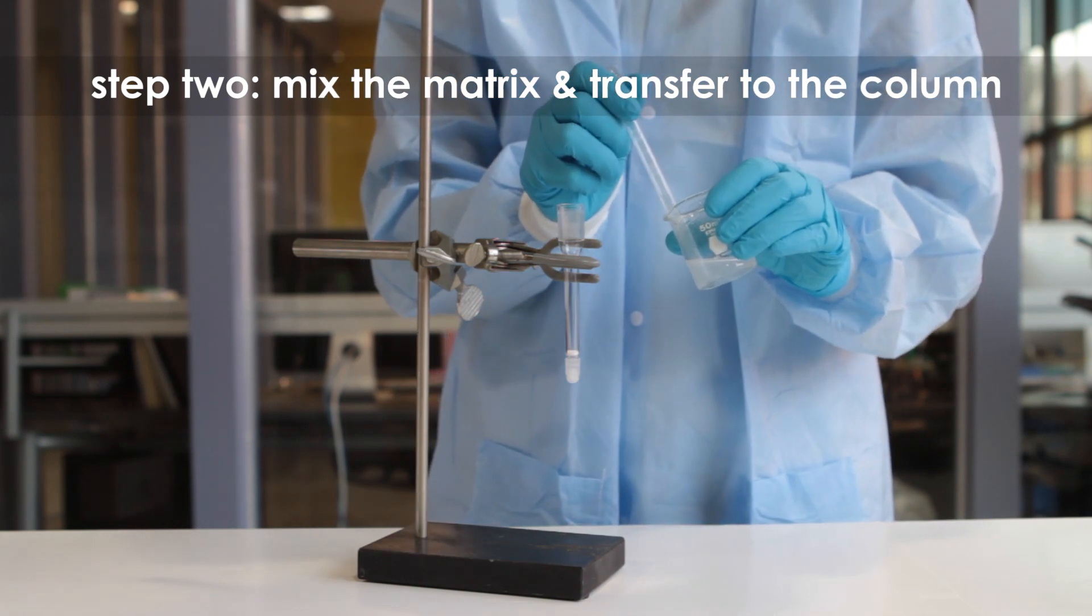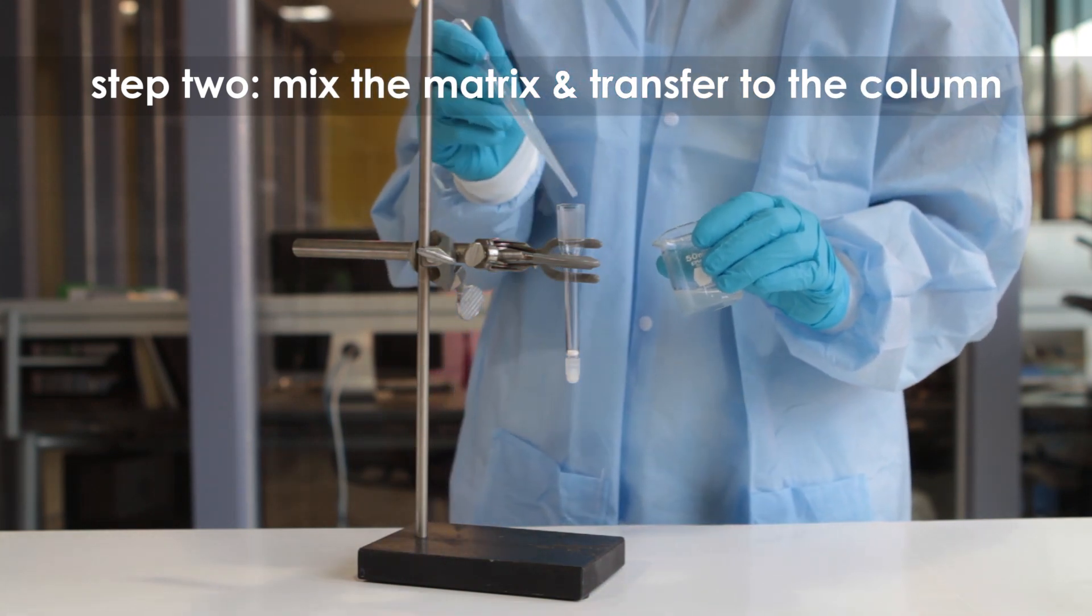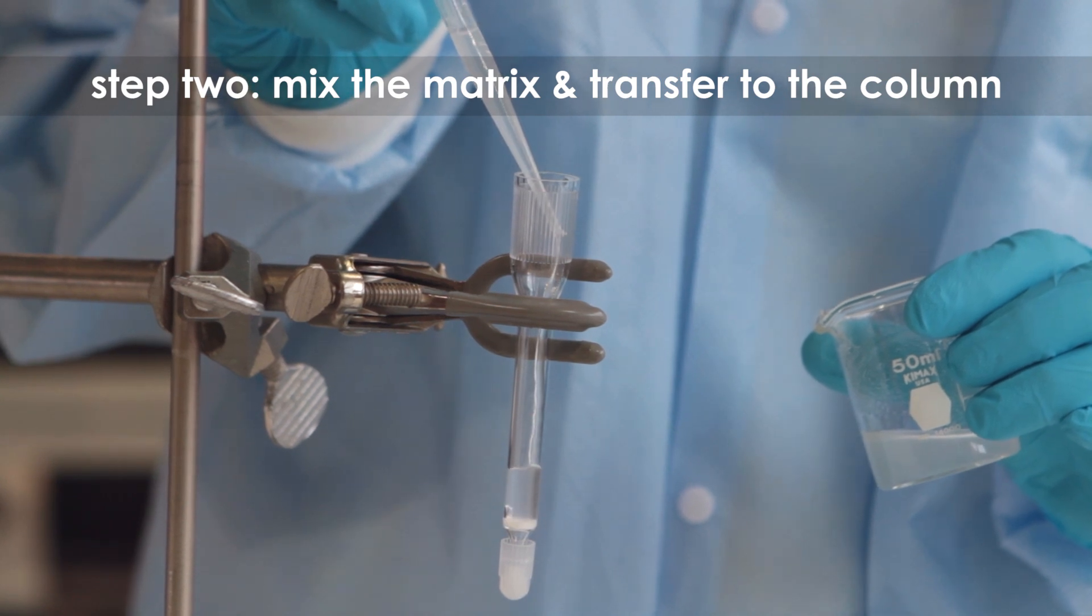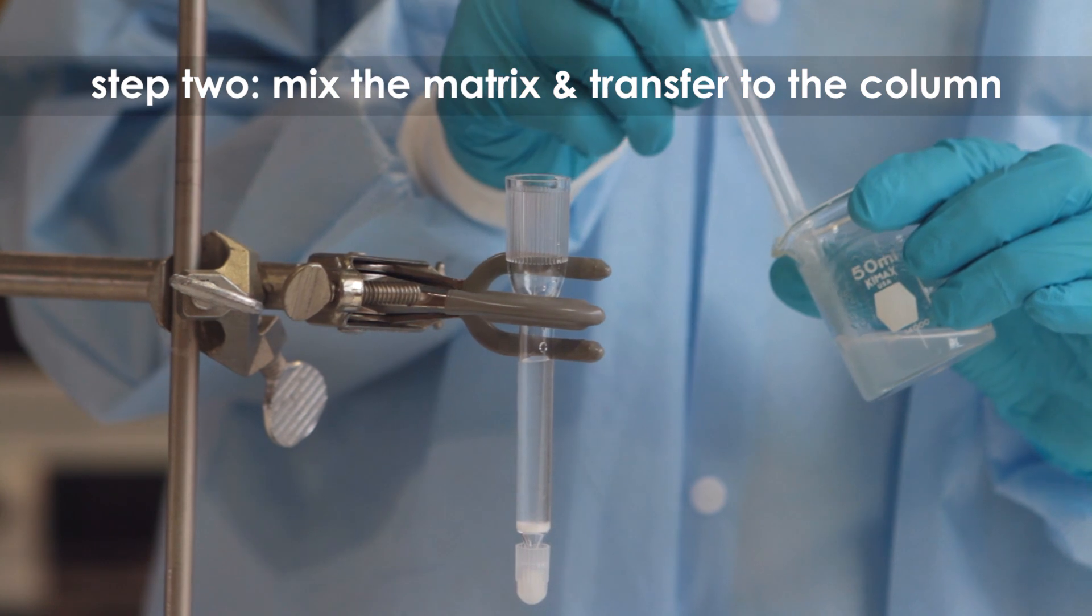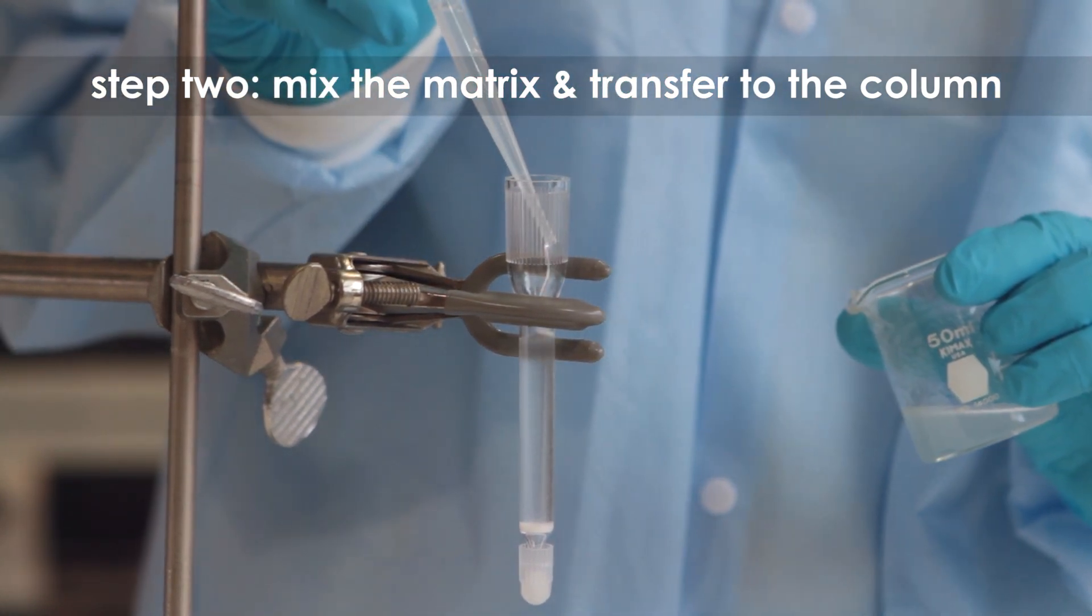Using a pipette, carefully transfer the slurry into the column by allowing it to stream down the inside walls of the reservoir. If an air bubble stops the flow of matrix, firmly tap the column until the air is removed and the slurry flows down.